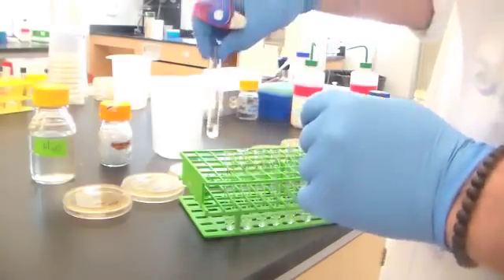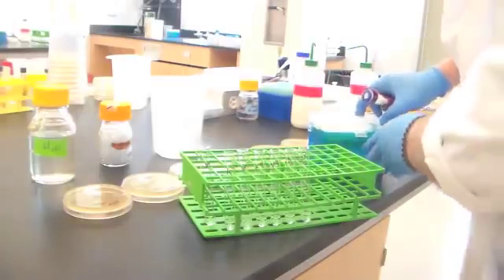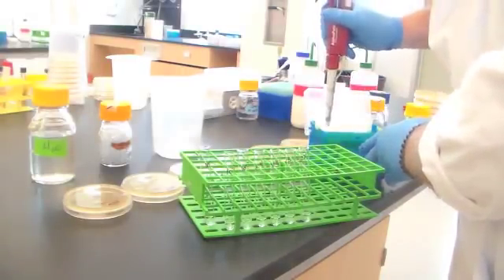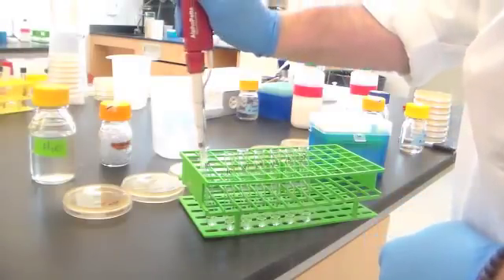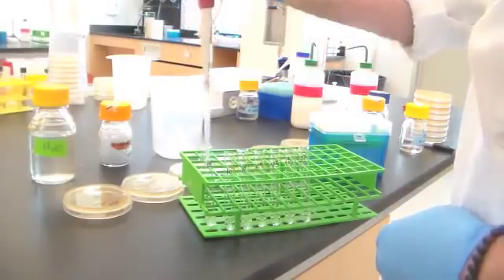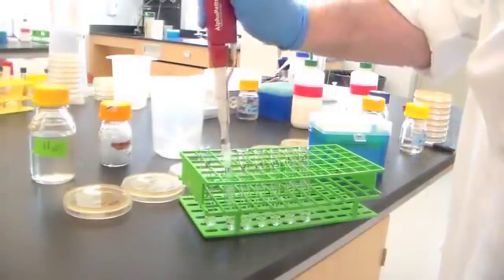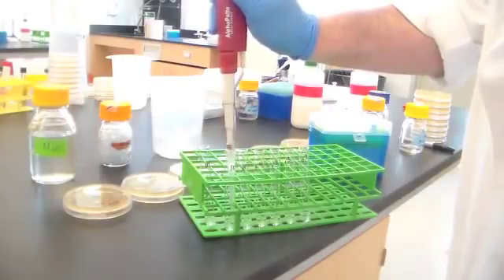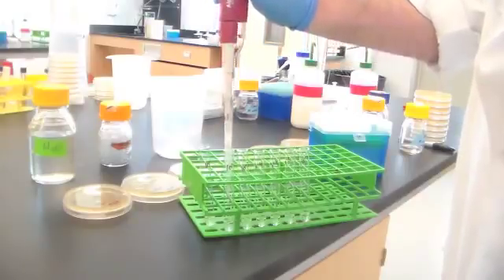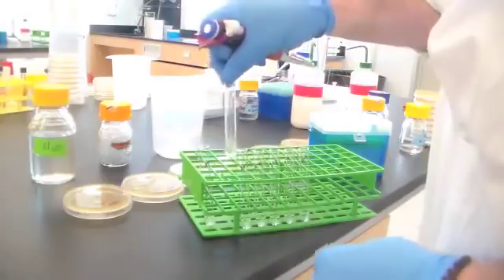Now, my way to make sure I don't confuse myself is I'm setting that back into a different row, because now I want to put on a new pipette tip. I'm going to take 100 microliters from that 10 to the minus 1, and I'm going to put that into the 10 to the minus 2, and I'm going to pipette back and forth or triturate to rinse that pipette, push out to the second stop to make sure I've left it all behind, change the pipette tip.